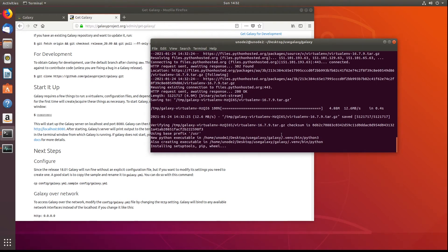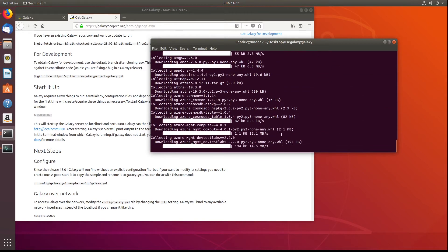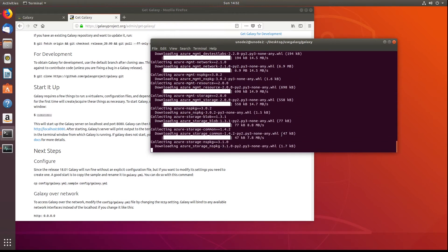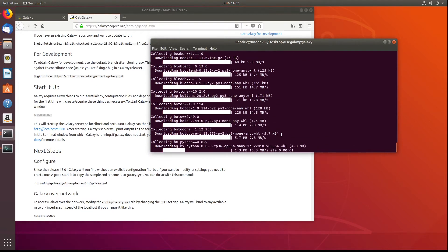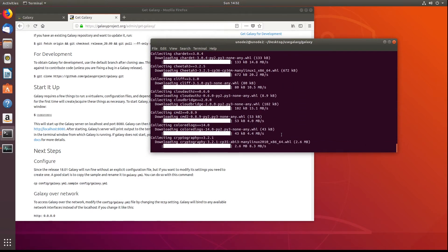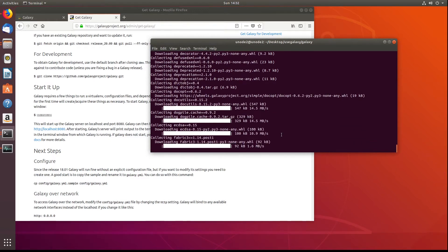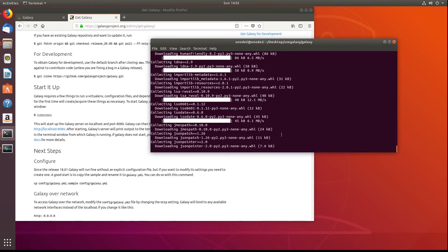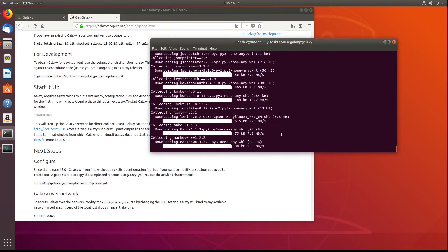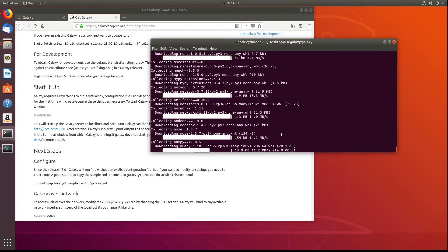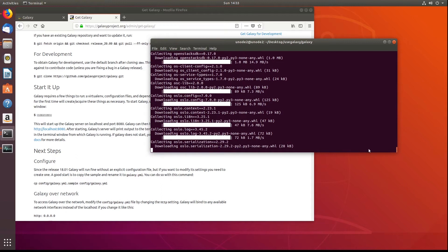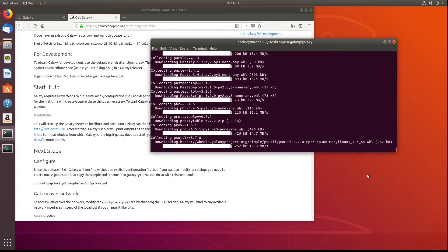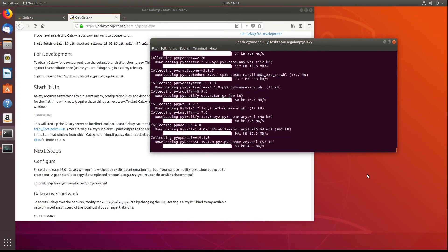This also will take a fair amount of time, and there's some warnings, but ignoring them still allows the program to run for some reason. So I just ignore all of the errors here, unless it's something that's fatal to the installation. If you get some of the errors that I didn't get, I just suggest Googling them and see if there's something that you have to install if it is a fatal installation error, since I don't have experience with them. And it seems pretty easy going, even if there are some warnings here, as long as it doesn't fault out. Like I said, this is going to take a long time, even on the workstation that I have. So I'll fast forward through all of this, and I'll put a time maybe somewhere on the screen to show just how long it takes to install this. That way you can determine whether or not it's something that you want to do, or you just want somebody else on like a cluster to go ahead and do that. So I'll see you in a little bit.